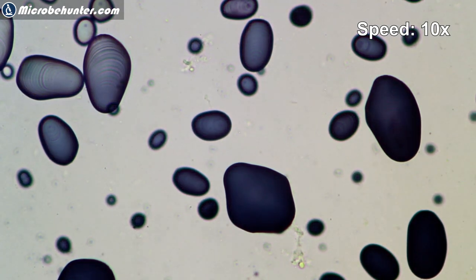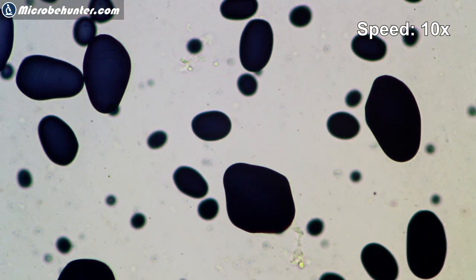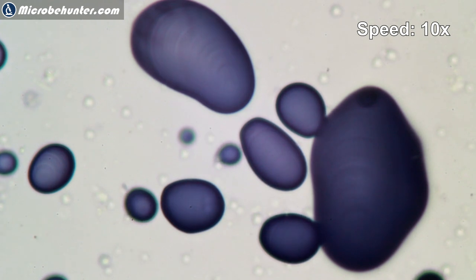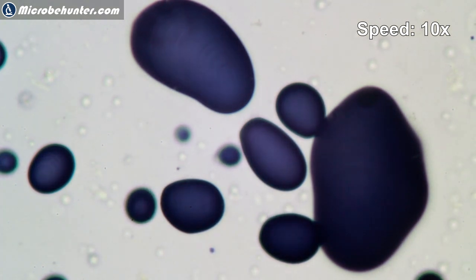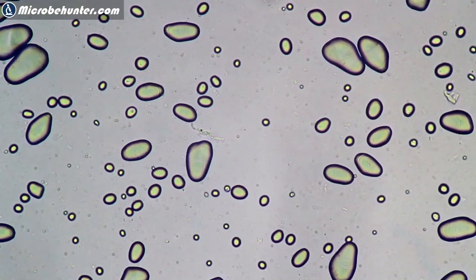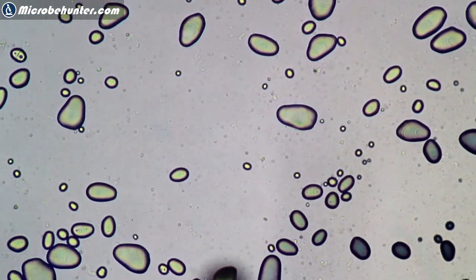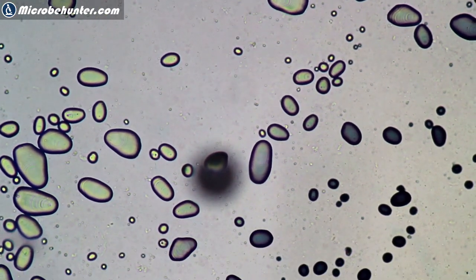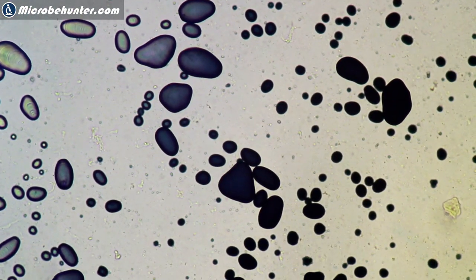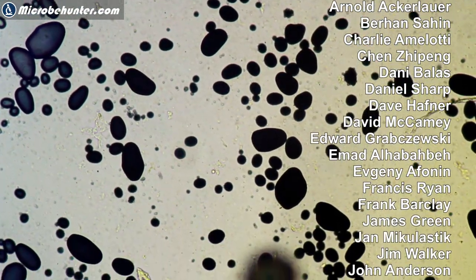Here at slightly higher magnification, the starch grains are staining dark purple, dark blue, and even all the way up to black. If you look very carefully you can see that those starch grains are layered. Starch is our fuel — pretty much all cultures in the world rely on starch as their main energy source; it's basically the thing that we humans live off. Now I'm simply going to scan the slide, and you can see how as we move into the iodine solution the starch grains start to stain black. It's a quite nice, easy, but also very impressive way to observe this.